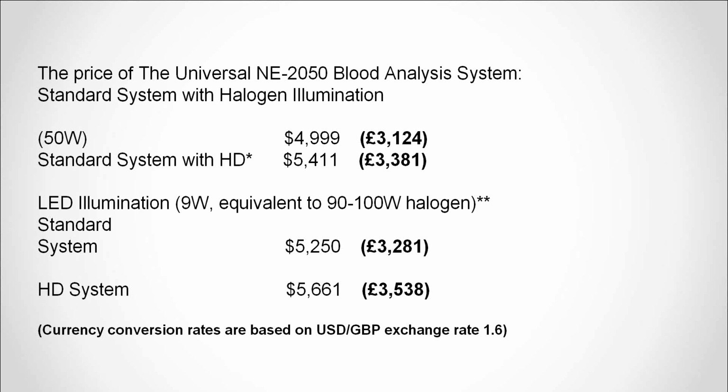And also the benefit mainly with the LED system is that the LED lamps last a lot longer than the halogen type of lamps. So for clients that prefer not to have to change the light bulb in the system from time to time, the LED system would be more suitable.